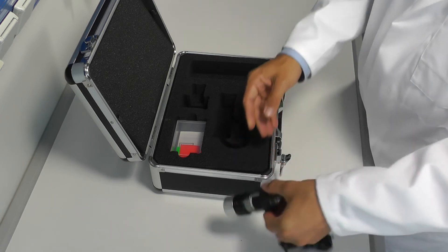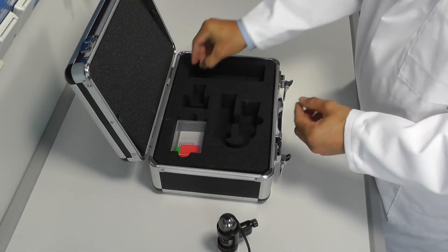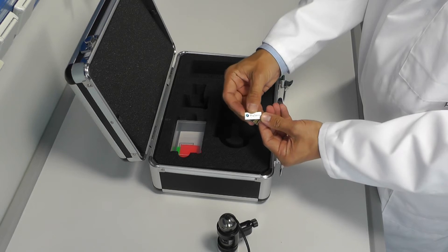You will also find a USB stick which contains the VCSend software, instruction manuals, and other useful information files.